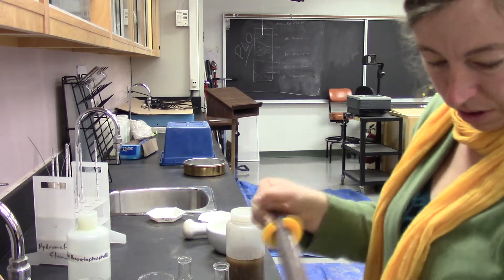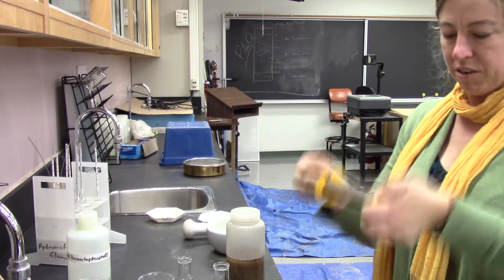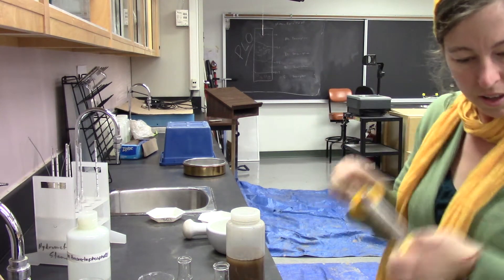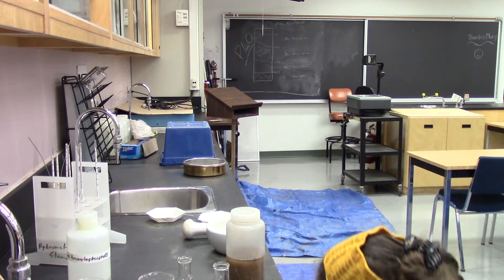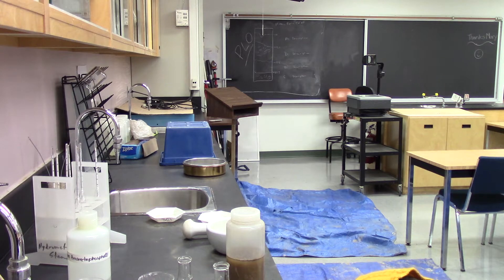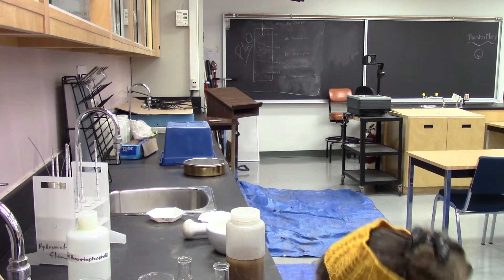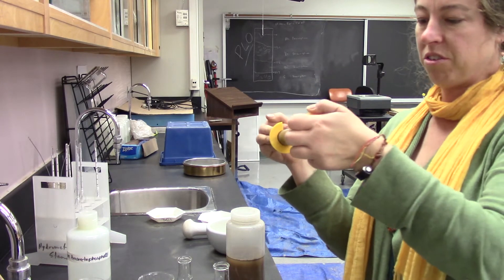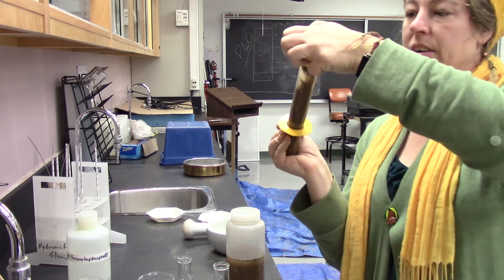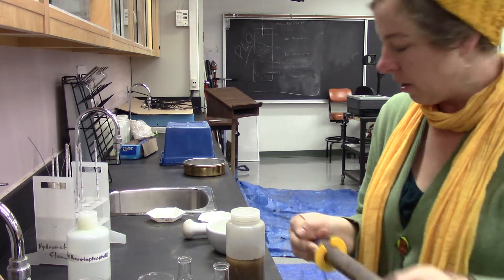I didn't think it would be that difficult, and I've got to keep an eye on my timer so I can measure how much I have after a minute. I have almost exactly two centimeters, which means most of my sample is sand. I thought I had approximately two centimeters in there — there were air spaces and pore spaces that have now disappeared, but still mostly sand.